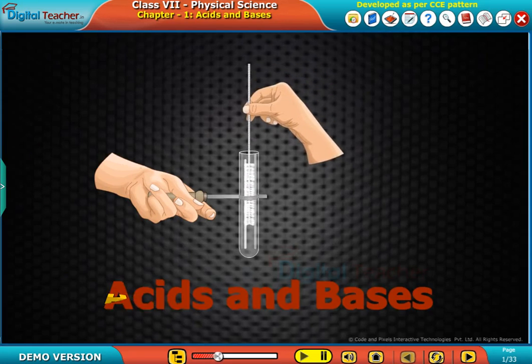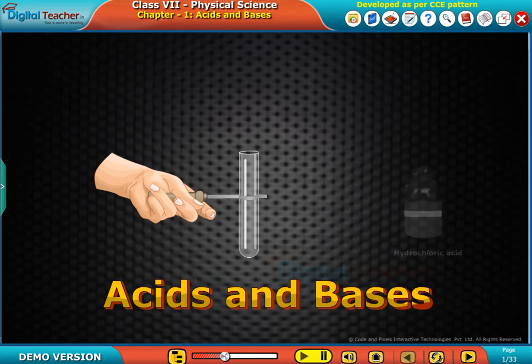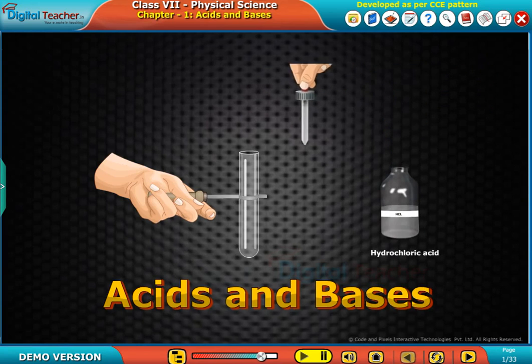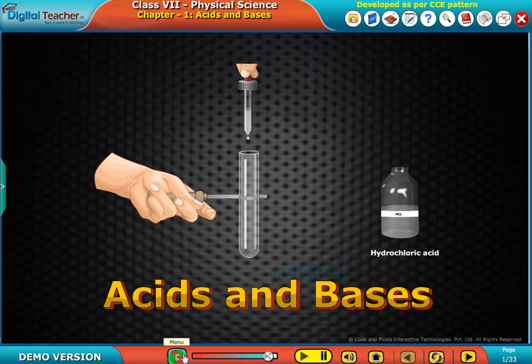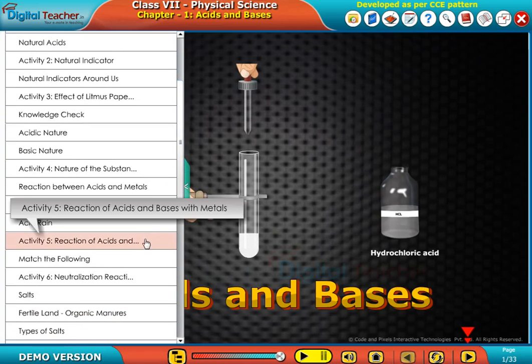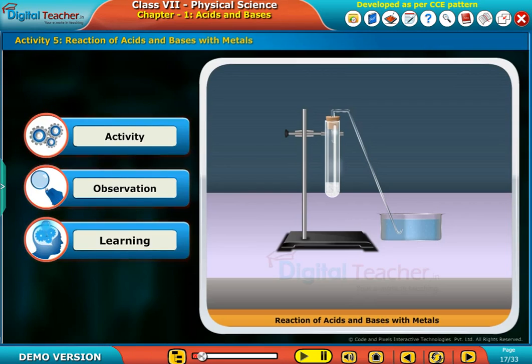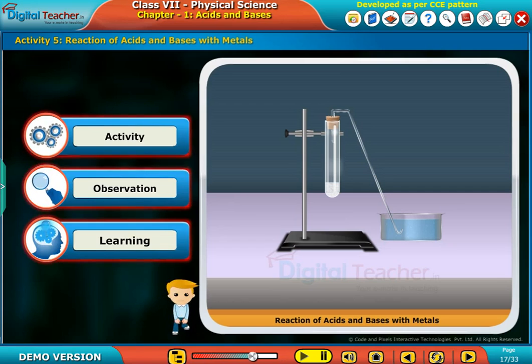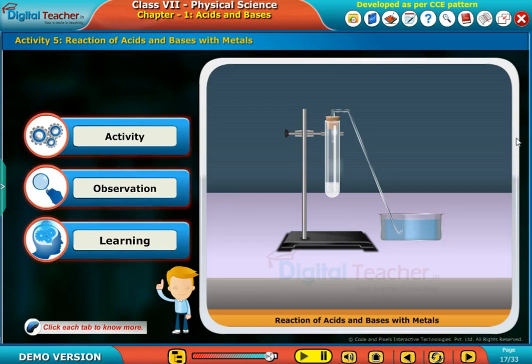Welcome to the chapter on acids and bases. Here, let us perform an activity to know about the reaction of acids and bases with metals.